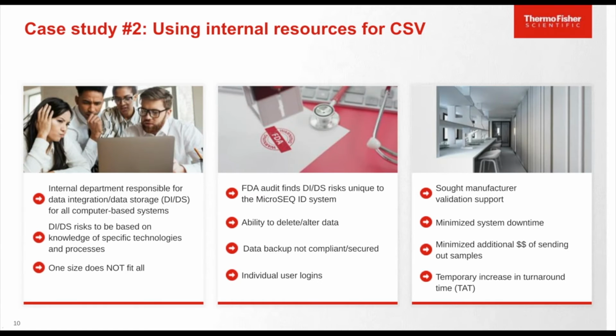Data backup was not compliant and secure with current federal regulations under the FDA. And there were individual user logins that also weren't compliant. And this resulted in an FDA finding at their audit. This puts the customer at great risk. When you're under an FDA finding, now you're under a timeline in order to get this fixed.